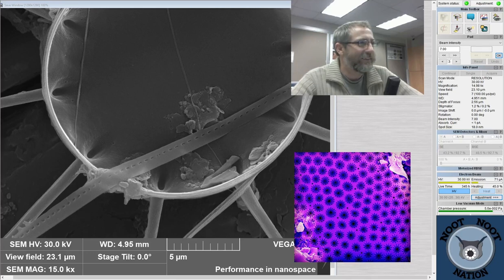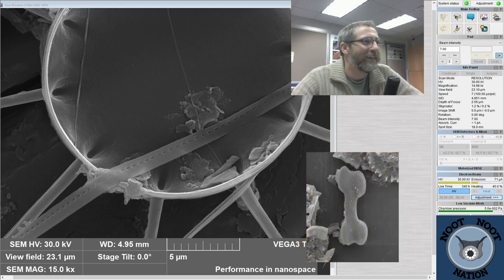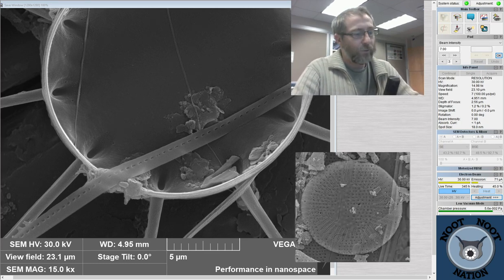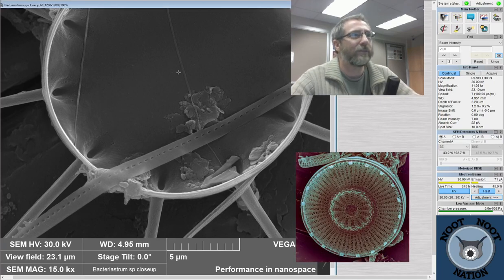Okay, let's see. I've almost caught up with the bottom, so is that stuff on top of it or inside of it? Stuff's on top of it that you're seeing. So, hey, Mama Bonbon, hello. Are the pores small enough to use calcium or sodium ions to exchange channels to transport, or is it like larger scale transpiration? Those holes are really small. And then this diatom in particular, those little tiny holes are so small that I can't even easily resolve them in the scanning electron microscope where we are. So usually they're in the sort of 1 micron range, but ions, which is what you're talking about, I think, are even smaller. So I think it'll be fine for transmitting ionic composition through them pretty easily.